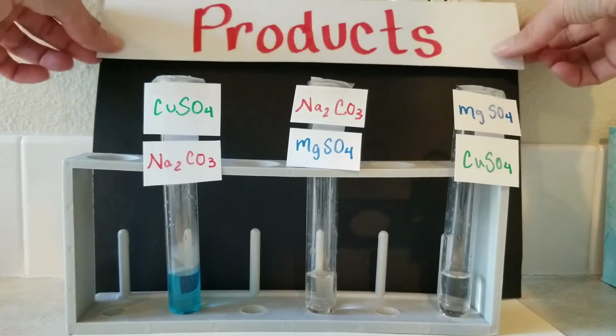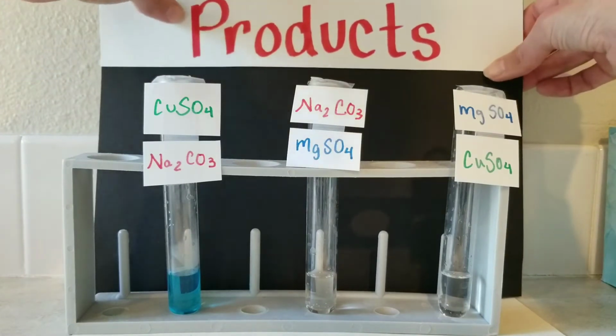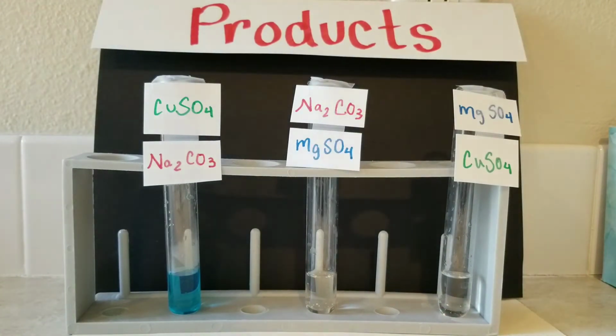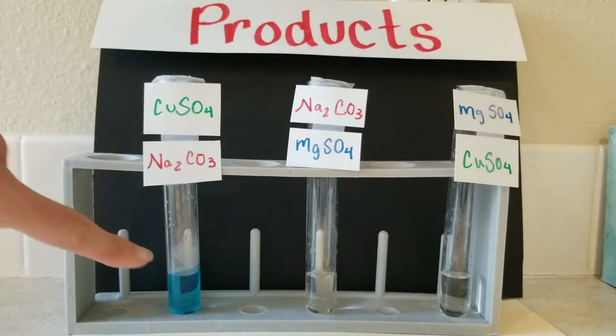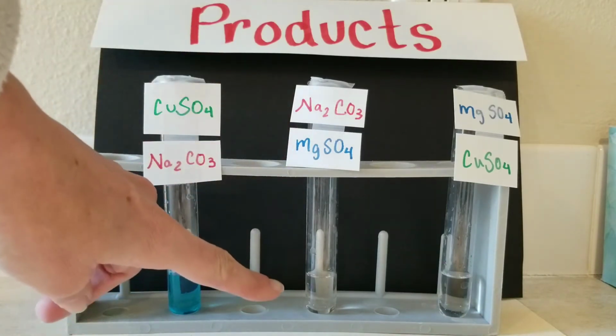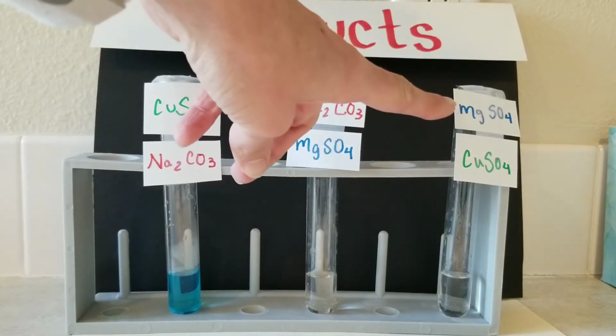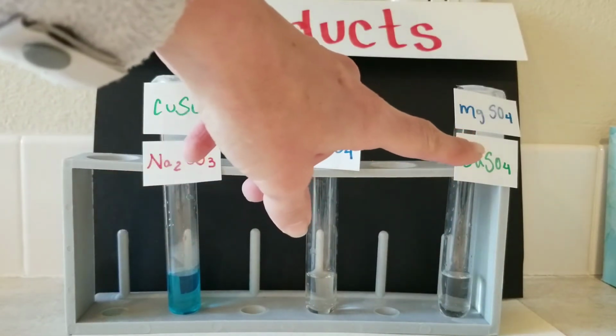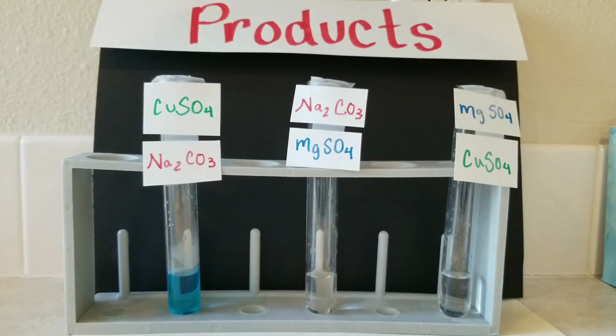So now what we're going to do is add together the different substances that we looked at for our reactants. So we've got copper sulfate already in this one. We've got the sodium carbonate in this one here already, and the magnesium sulfate down here. We're going to add to each of the test tubes the substance on the bottom, and we're looking to see if a reaction has taken place.